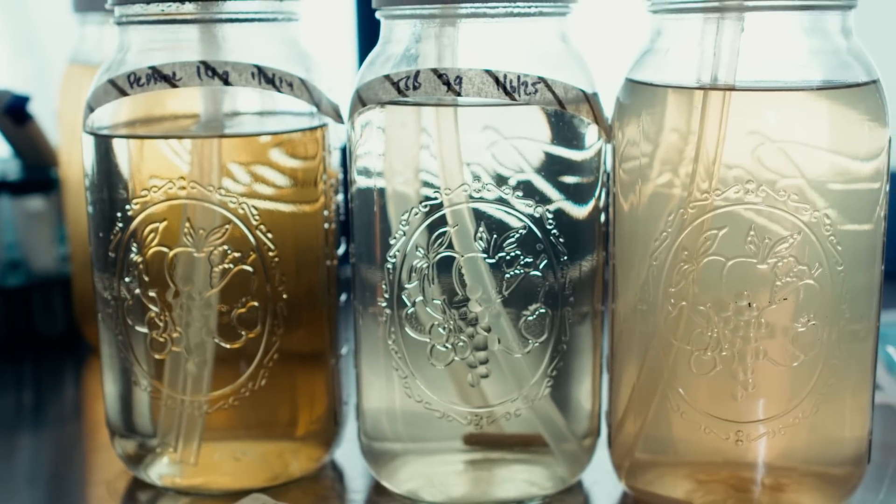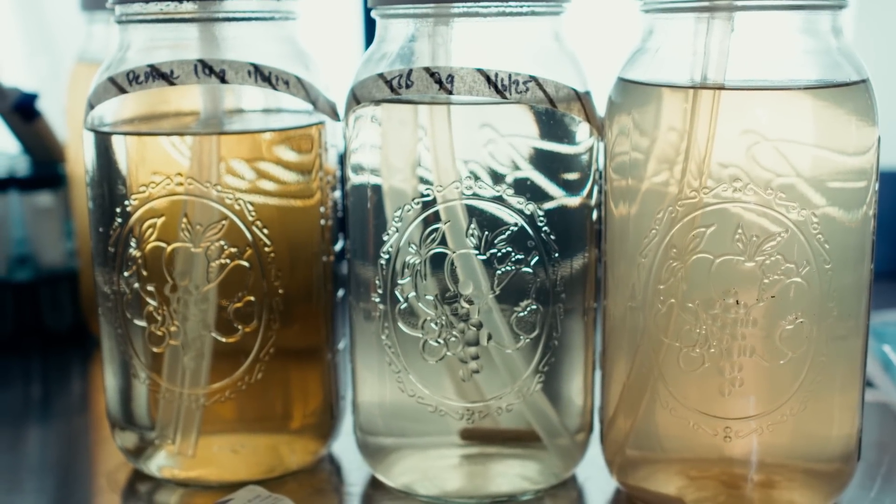What is the best liquid culture recipe? There are hundreds of different recipes out there. You can get as complex as all the micronutrients or as simple as organic honey. I'm going to choose three different recipes, explain why, and then we're going to figure out what the best one is.